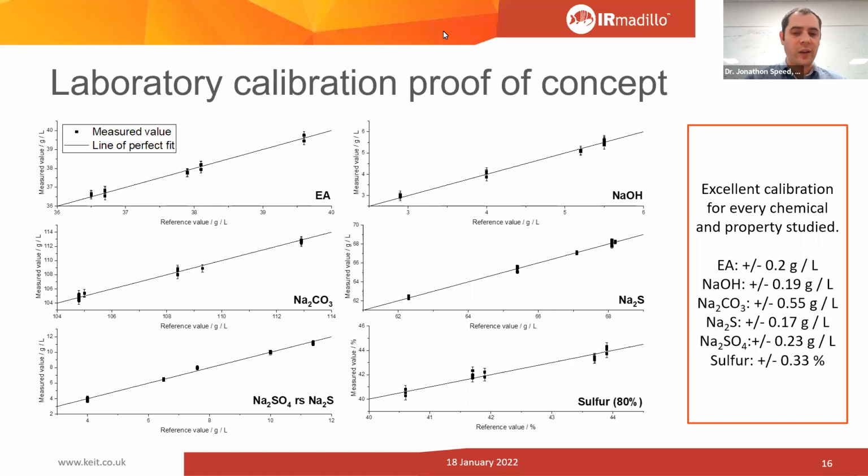Because the way the probe works is it sees things that are very close to it. So liquids fill the gaps so that they're really easy to see. Particles, as they're moving, it does depend on their morphology. And that's why things like fibers are not a problem. But the flip side is that means we might not be able to see it. So I don't know. If there are samples that can be prepared, we should definitely have a look.